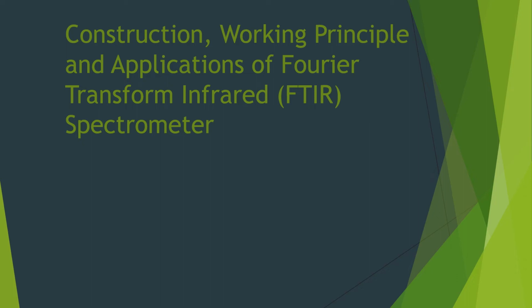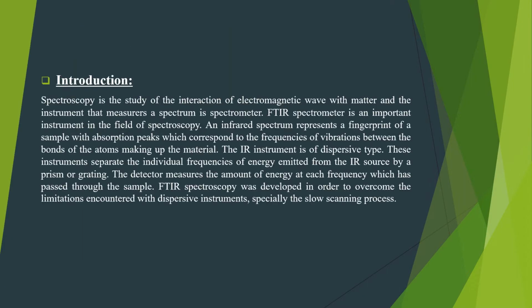Construction, working and principle of FTIR spectrometer, Fourier transform infrared spectrometer. Introduction. So let us see what is spectroscopy.